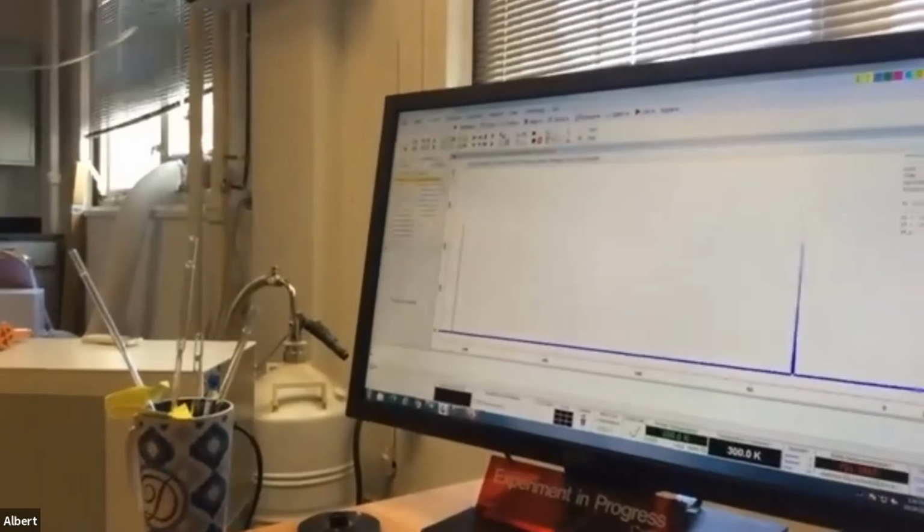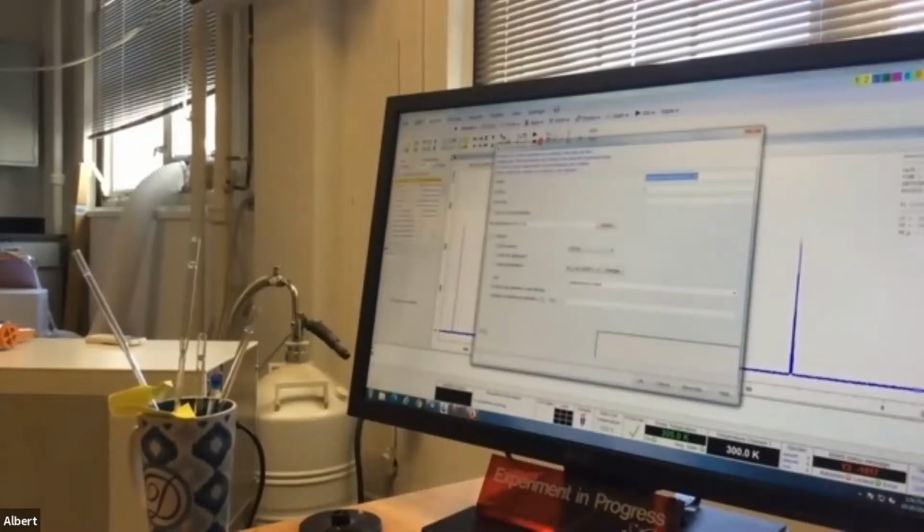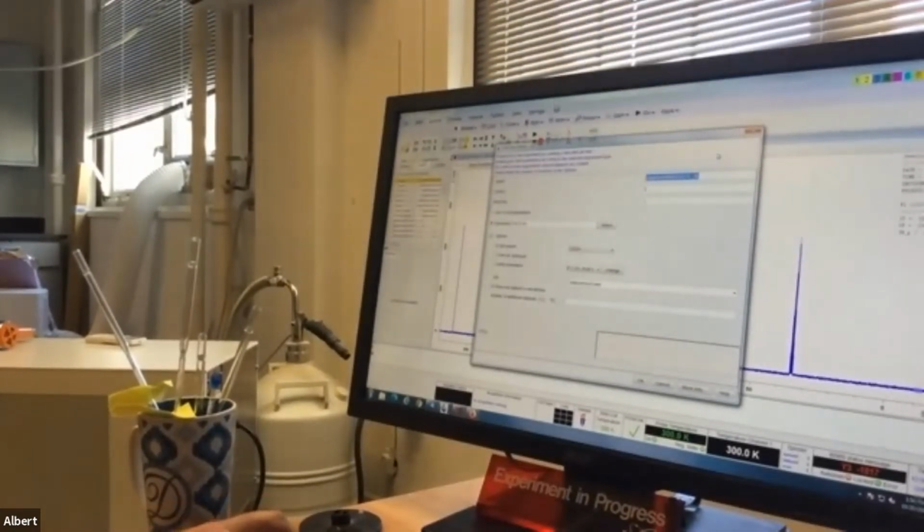On the control panel, hopefully y'all can see the screen. Let me move this out of the way. That's perfect. All right, so on the control panel, go to File up top and New. Yep. All right, so change that name to Sample 1, 322-02.